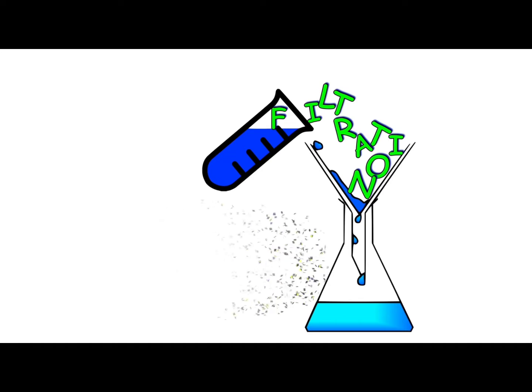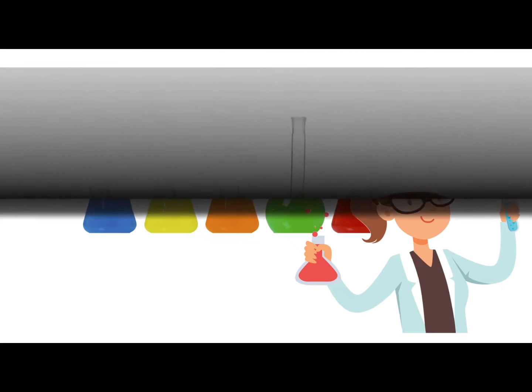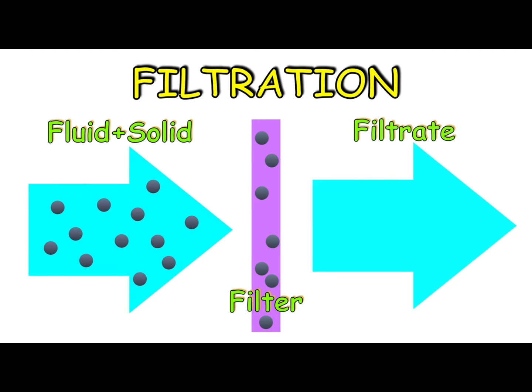Filtration. Filtration is the process used to separate solids from liquids or gases using a filter that allows the fluid to pass through, but not the solid. The fluid that passes through the filter is called filtrate.